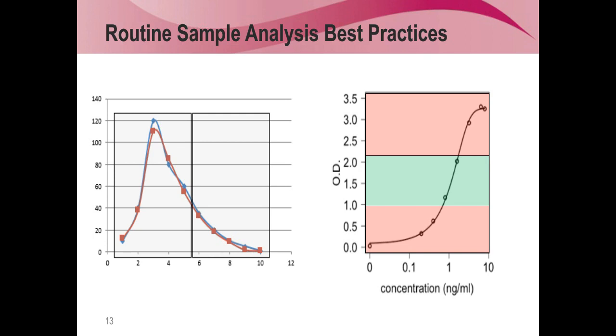You want to put half of those from the biosimilar and half from the innovator at corresponding time points. And of course, because usually in antibodies you have a lot of dilutions, you want to optimize the dilutions so it hits the optimal spot of the calibration curve, which is illustrated here on the right side.